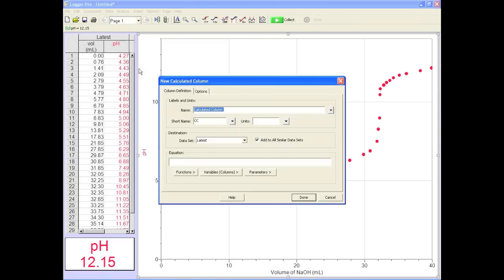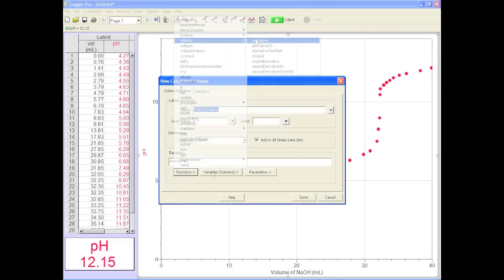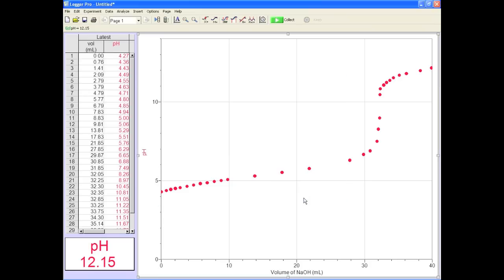Click on data, new calculated column. In the first box, name the function, say, first derivative. Give it a short name too. Now press the functions button, find calculus, and select derivative. Now press variables and hit pH. That's it.